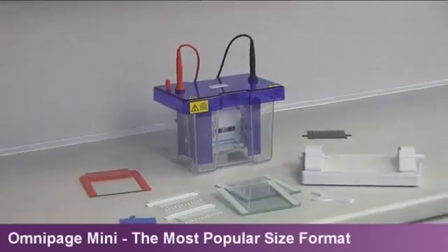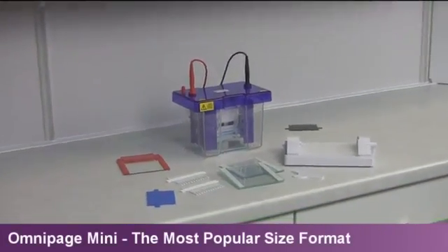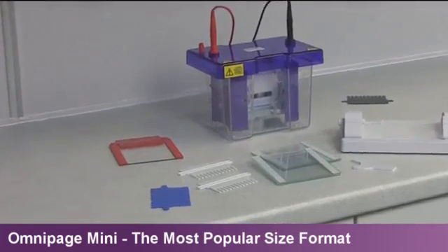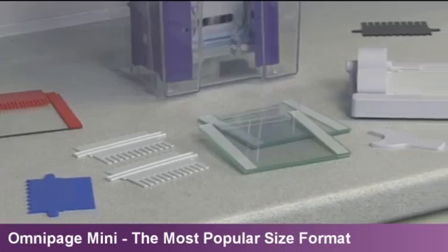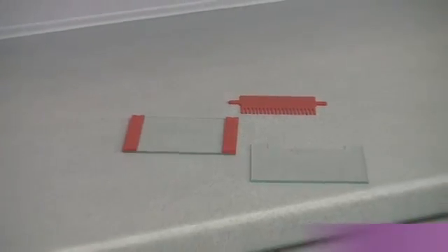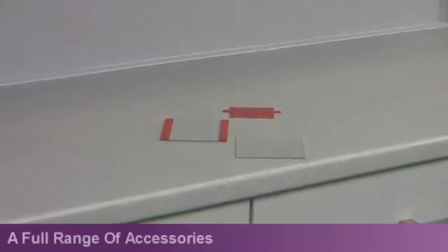Each Omnipage Mini may be supplied with a full range of combs, glass plates and accessories to cast and run up to four mini gels. Color-coded combs and spacers allow the user to select their gel thickness and sample throughput.